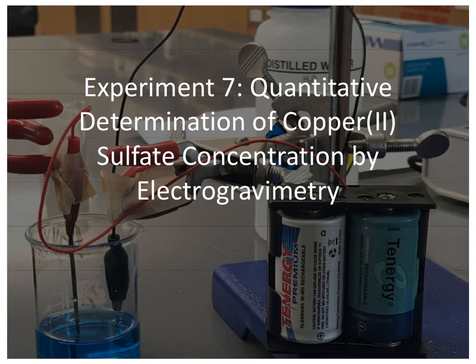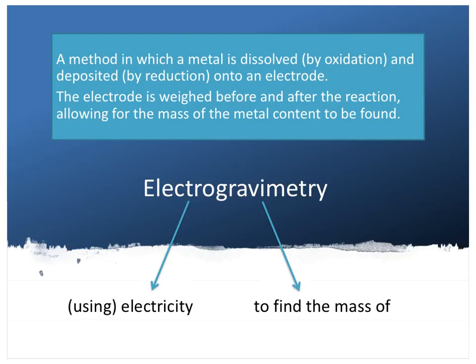This week, we will be doing electrogravimetry to determine the concentration of an unknown copper sulfate solution. The word electrogravimetry can be broken down into two parts, which, when thought about, can be considered a literal definition of what we will be doing this week. The first part of the word is electro, which could mean several things. Here we'll think of it as being related to electrons or electricity.